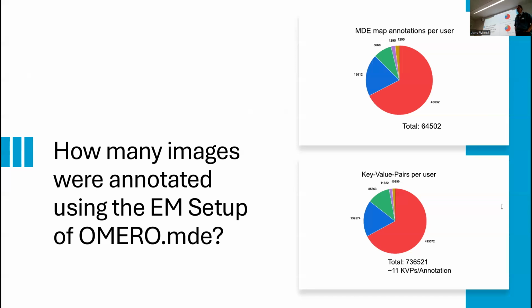Yeah, we do have light microscopes, but we tried and failed to motivate our light microscopy users to use the MDE templates. In every OMERO introduction, they are using it, so OMERO is quite well adopted, I would say. But I'm offering them all the time, come on guys, we create custom templates for you. I think I also created 1 or 2, but they are not used, obviously.